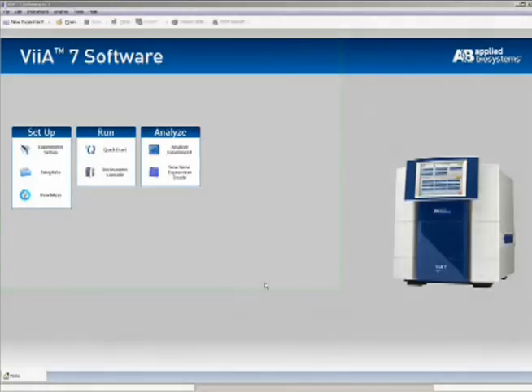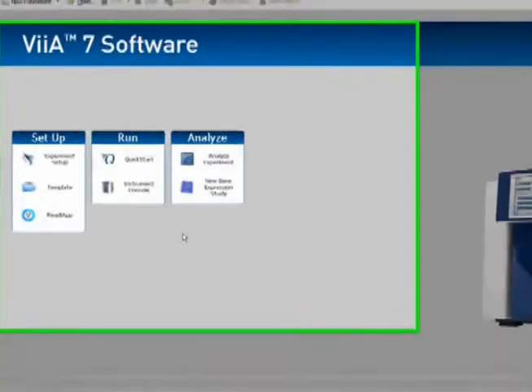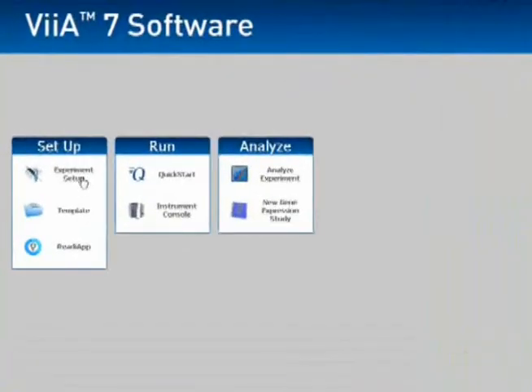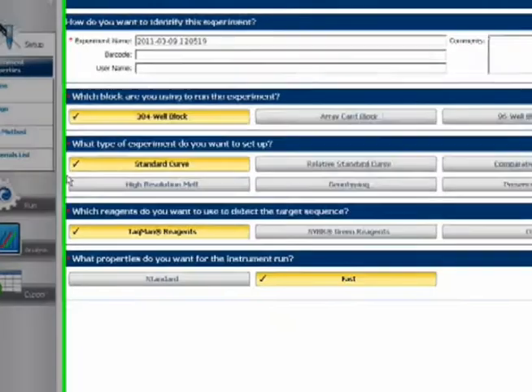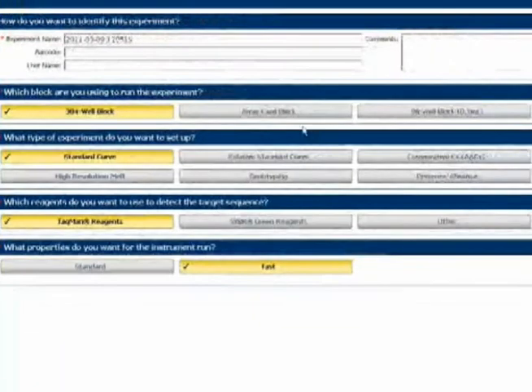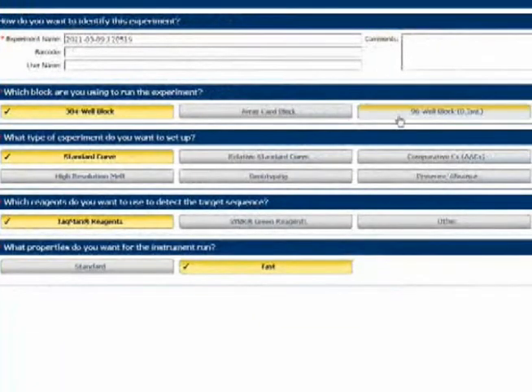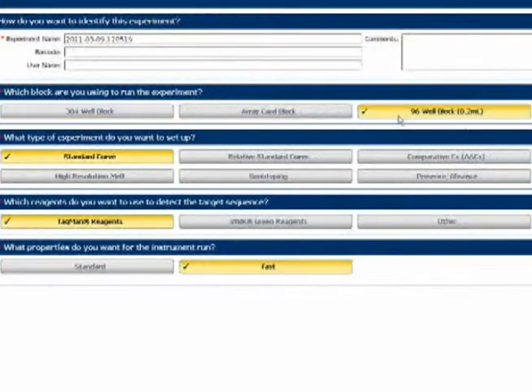Now I go back to the VS7 software and click Experiment Setup. I'll choose 96 wells as my plate type and confirm that standard curve is selected.